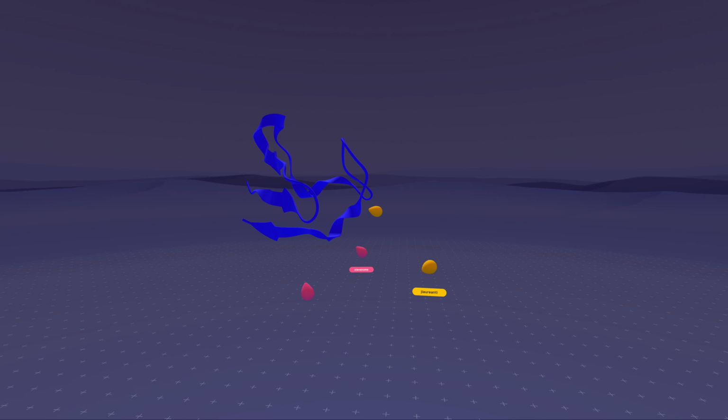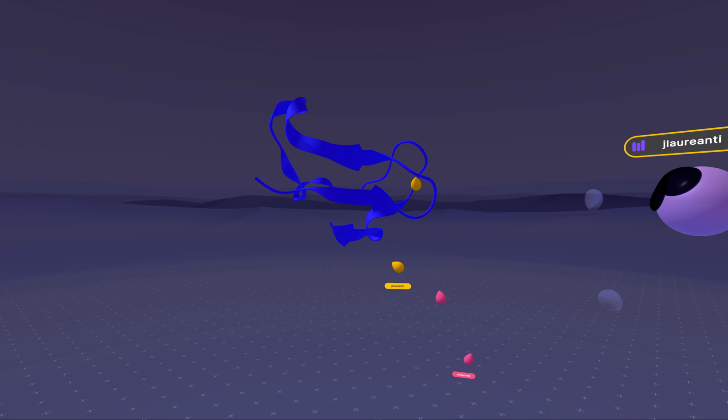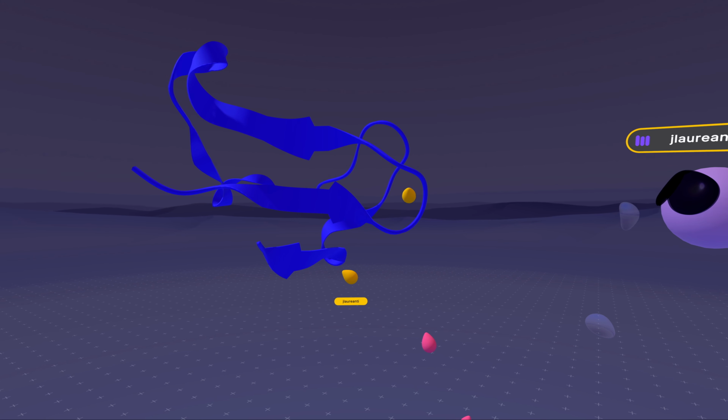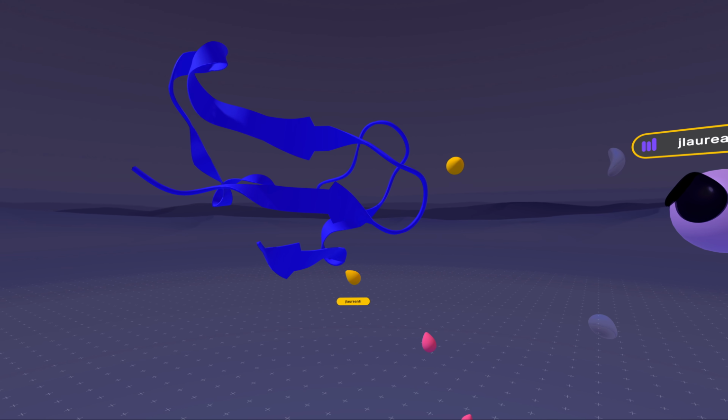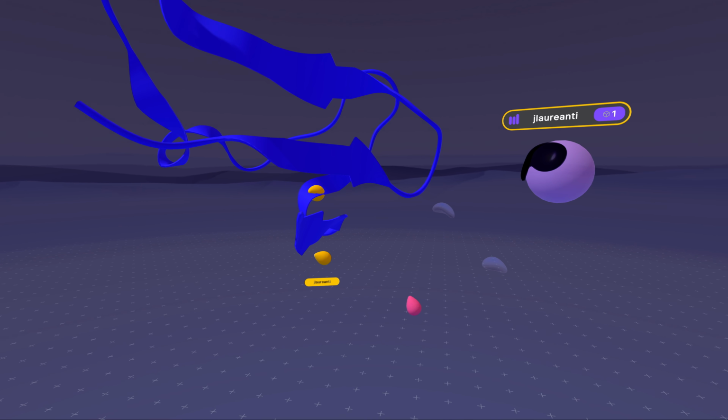And that's actually going to be in here. And then I was hoping to do some higher level calculations and see if adding a protein binder changed any of the electrostatics of the pocket there.